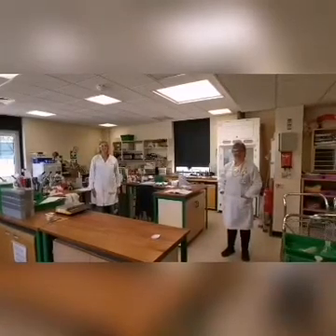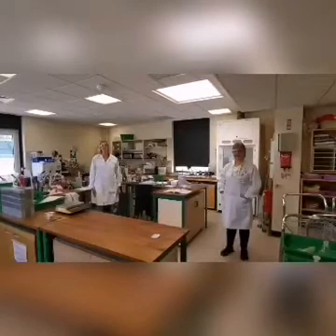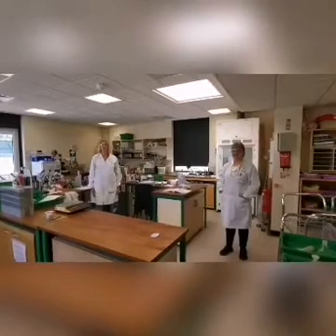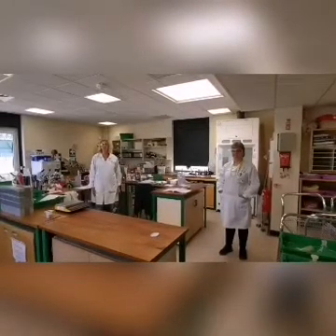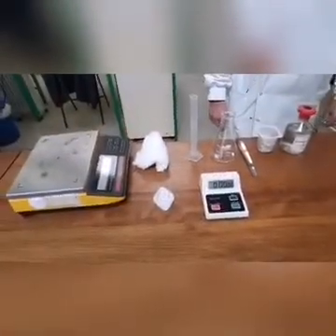Year 10, today we're going to demonstrate the practical for rates of reaction. There are two methods you can use. The first is loss of mass and the second is volume of gas produced. Method 1, loss of mass method.